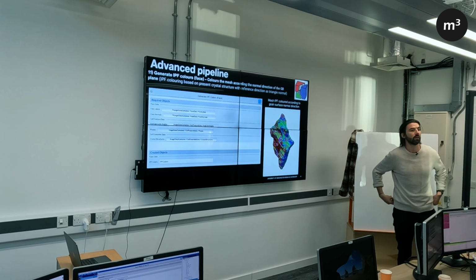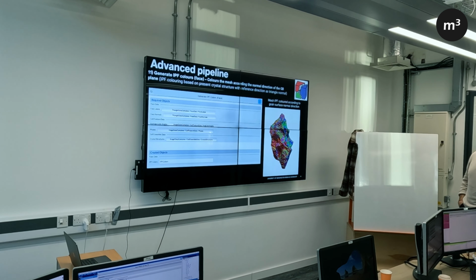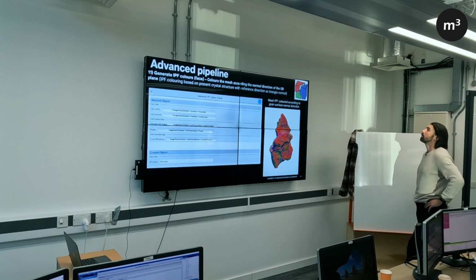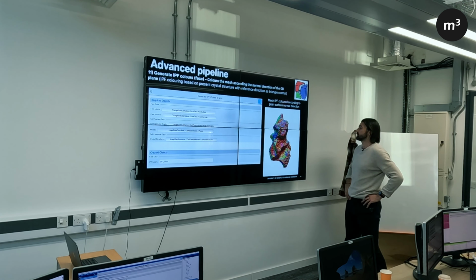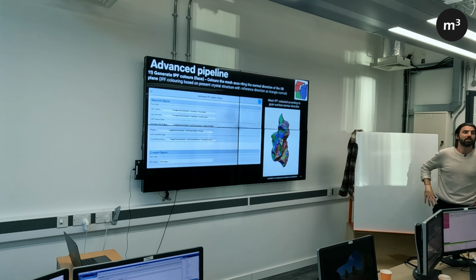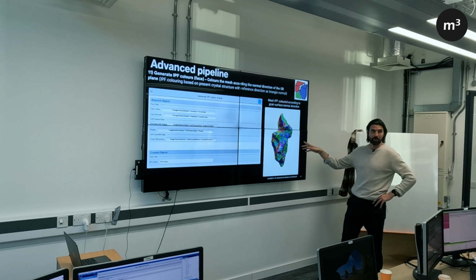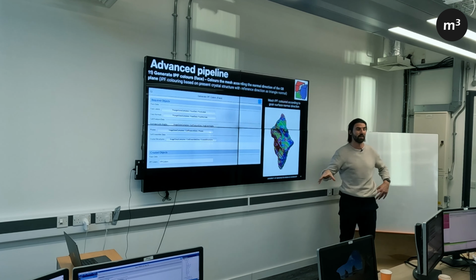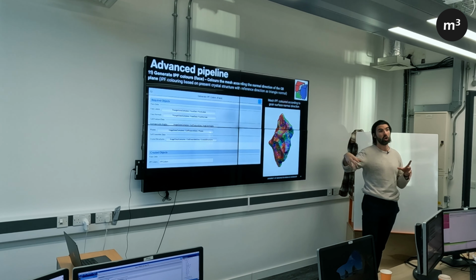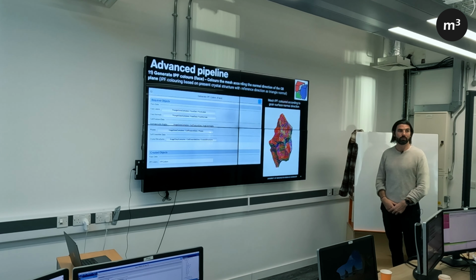Generally you can see there's a red-ish boundary, a greenish boundary, and sort of bluish-greenish. And that variation in colour could also come from your slices. Yes, so there's definitely some artifact. The mesh could not be perfect. 100%. I think there's an important thing here. This is showing up some artifact of the slicing and the fact that when we reconstruct in that Z direction, we're not getting a perfect alignment. Yes. Definitely, 100%.